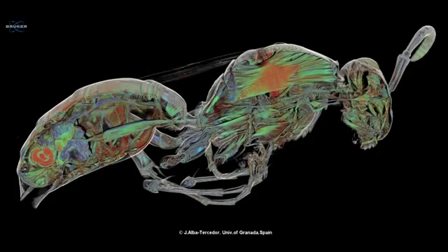With software, we can cut virtually the insect or the animal or any virtual sample that you can imagine. And even you can travel inside — you can go and close up.